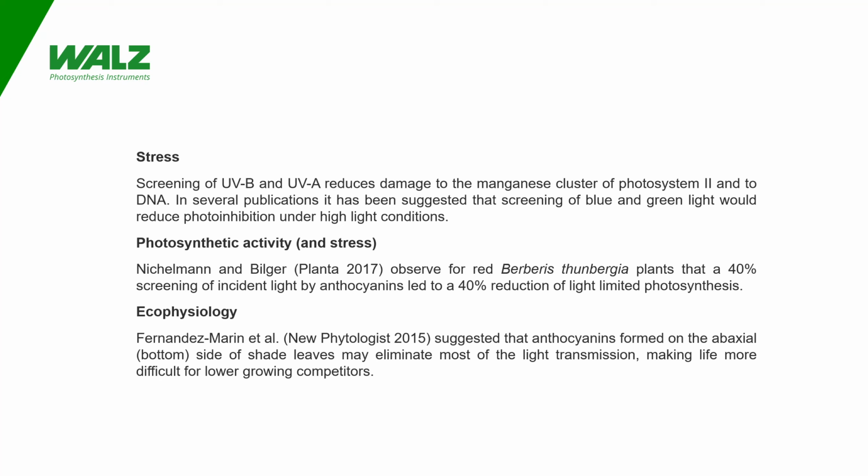That screening of blue and green light may have an impact on photosynthetic activity was shown in 2017 in Planta by Nichelman and Bilger, who observed for red Berberis thunbergii plants that a 40% screening of incident light by anthocyanins led to a 40% reduction of light-limited photosynthesis.